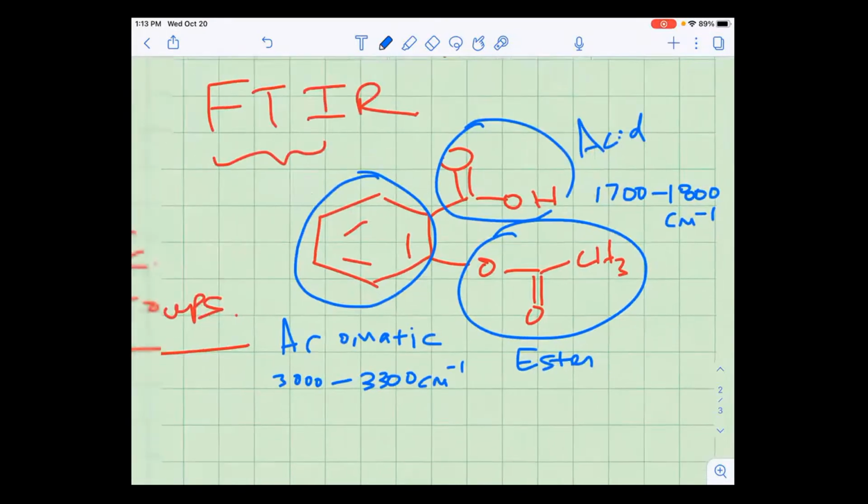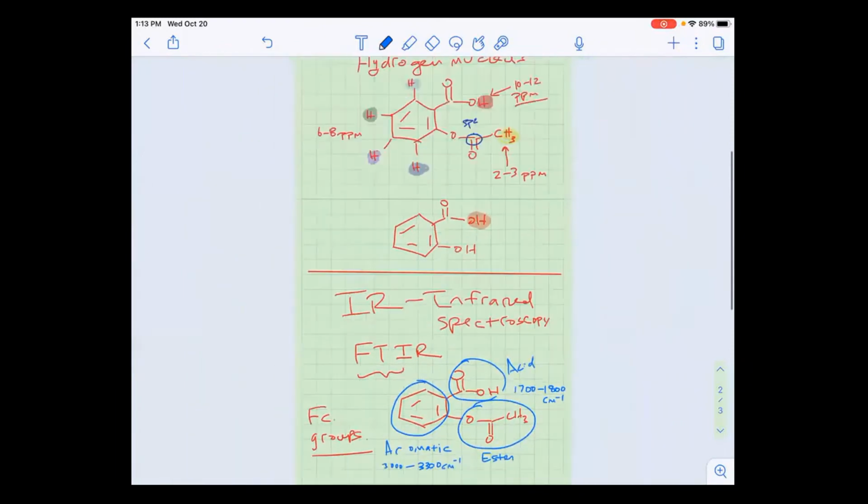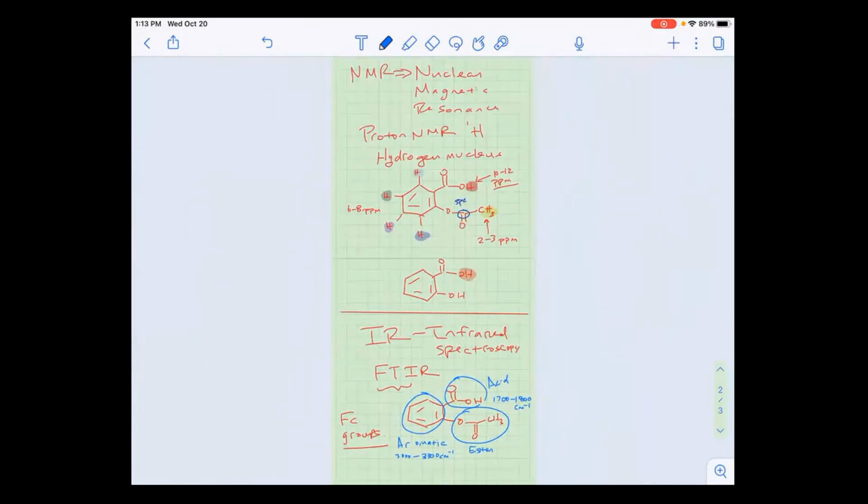All right. So what we're going to do now, any questions before we actually start working? We're going to set up one sample of the crude aspirin. We're going to take an infrared of that, and then we're going to take an infrared of one of our other samples. So we got Eli here. He's going to help to take one sample, and then I'll do the crude sample. All right. Any questions? Yes.